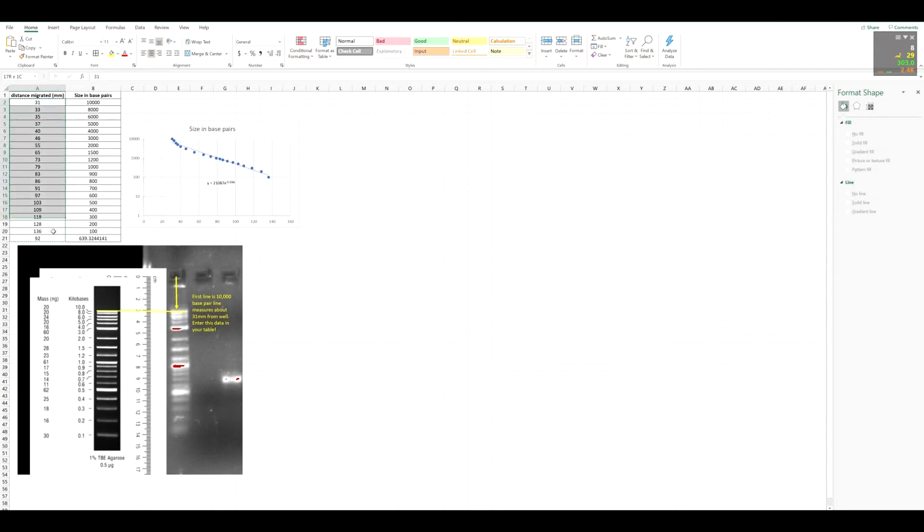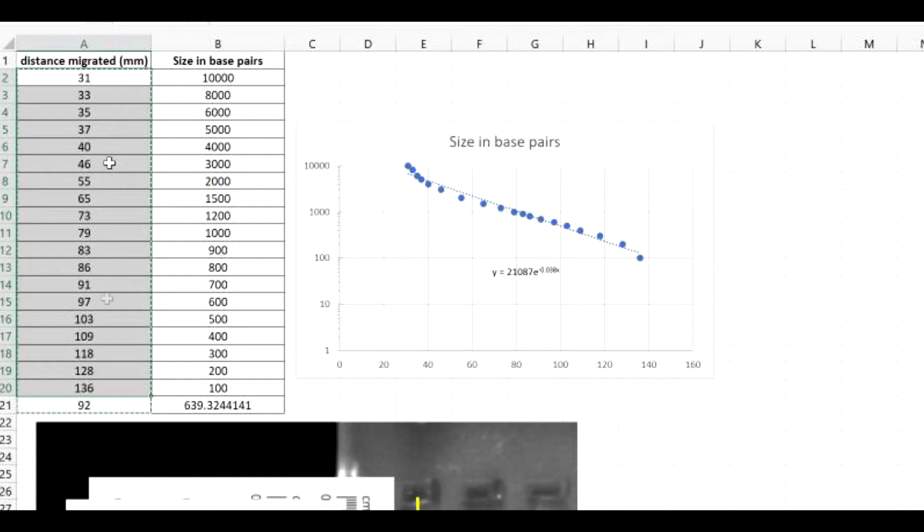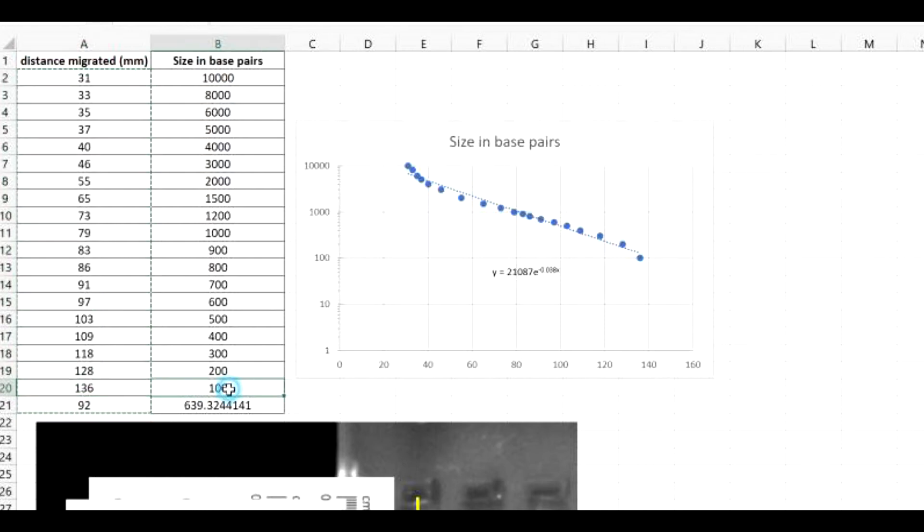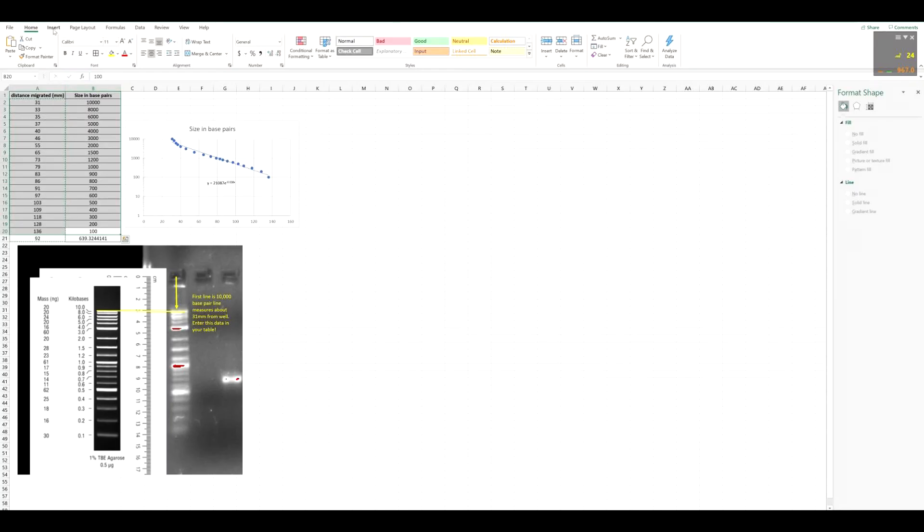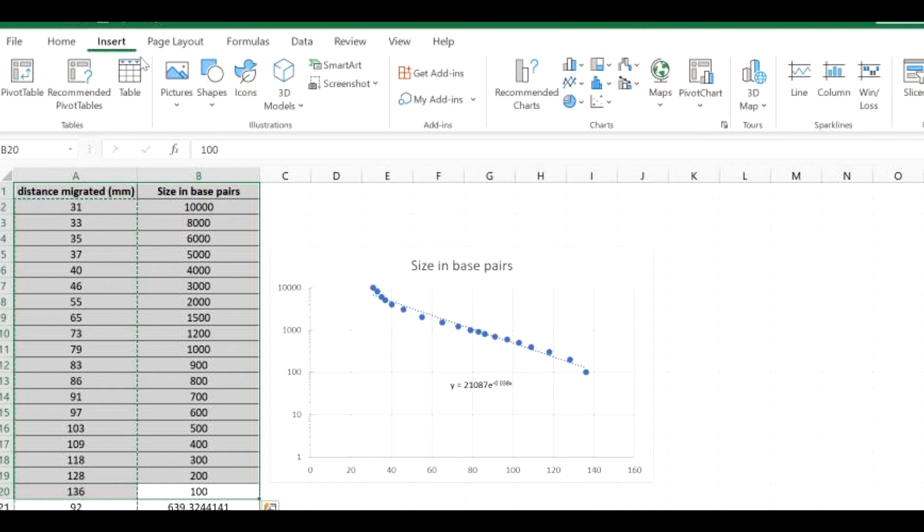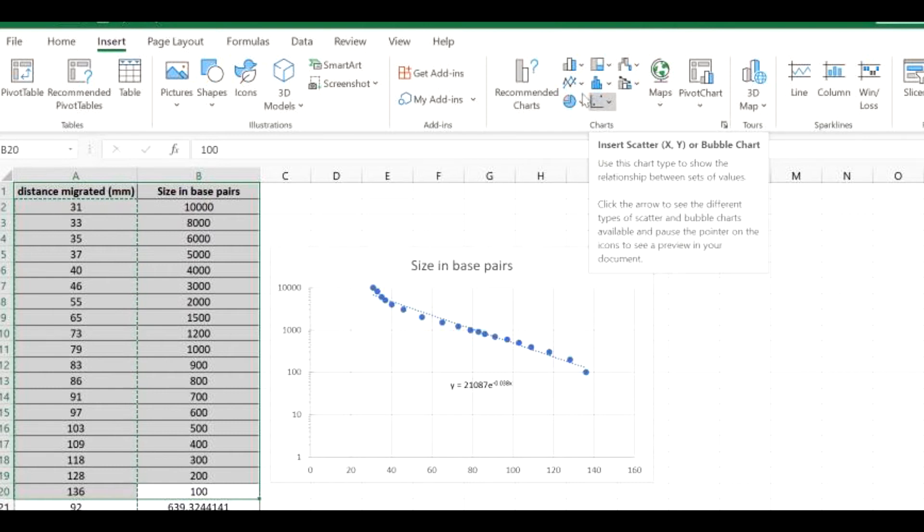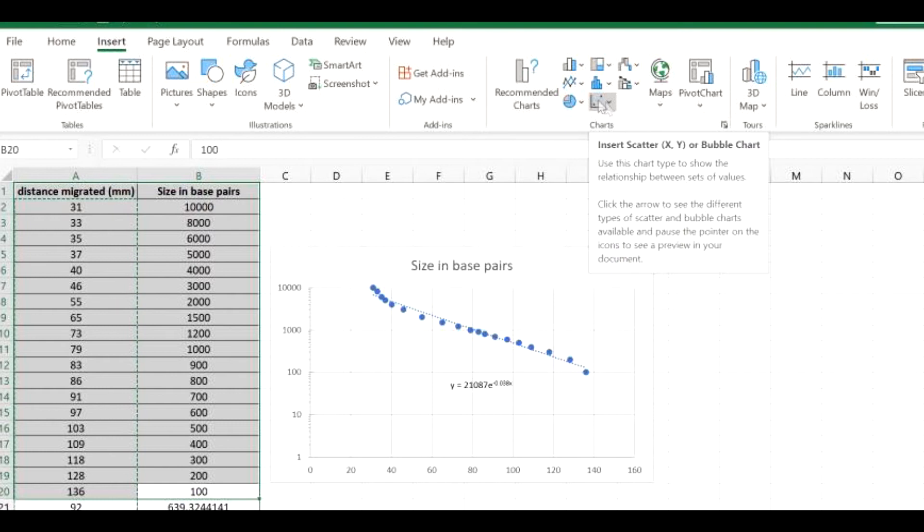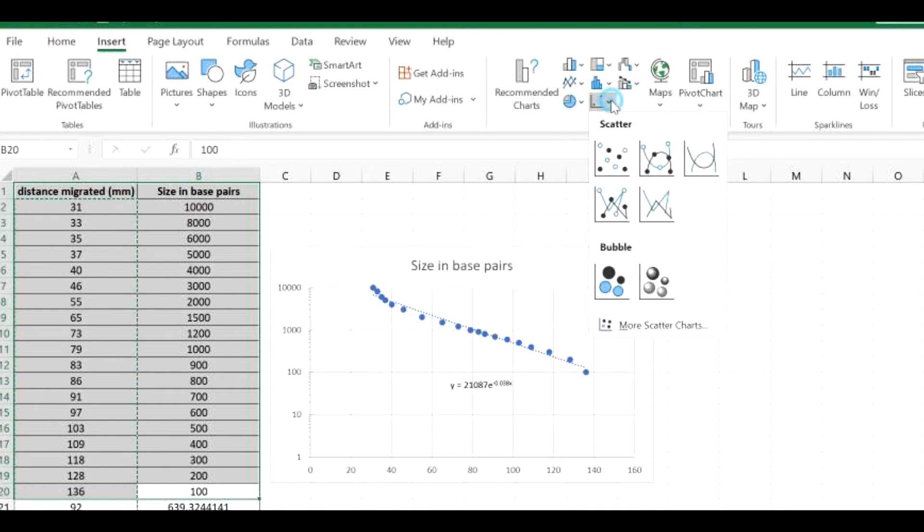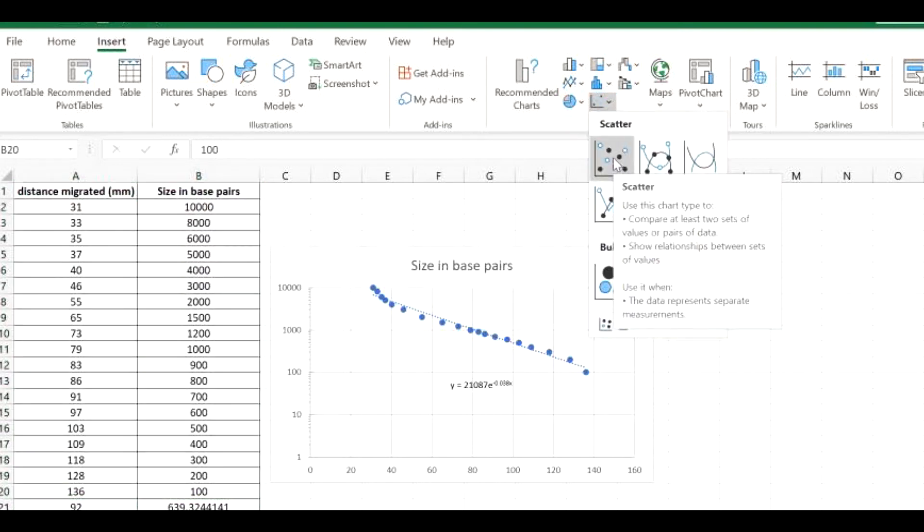Then you would fill out the associated distance here in this column A, or the first column, next to the associated base pair size. So when you have this data, all you want to do is select all of the data that you have. And then you want to go to Insert, Scatter Plot. So by recommended charts, you would just click this graph with dots on it, and then you would just do this first scatter plot here.